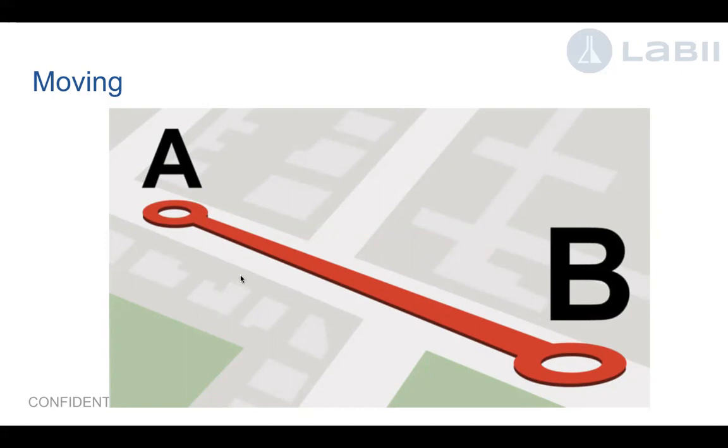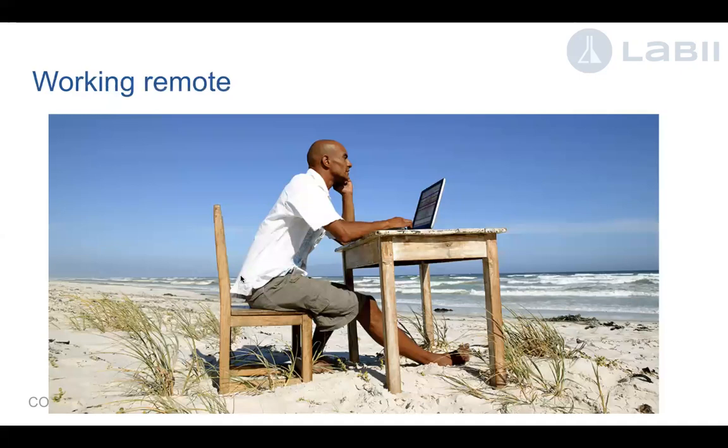They're using it a lot. One other thing is that during the pandemic, people were working remotely a lot, and difficulties came up. Previously, people needed to co-sign with each other, which means they needed to see the physical notebook, review it, and then sign it. Right now it's so much easier. You can just work on the beach or at home, open your notebook, review it, and see what experiment is going on. If something is wrong, you can write comments about it. If everything is good, you can just approve it directly. So this makes the whole procedure so much easier.